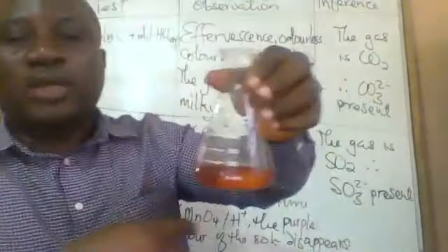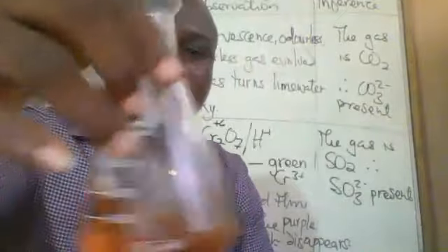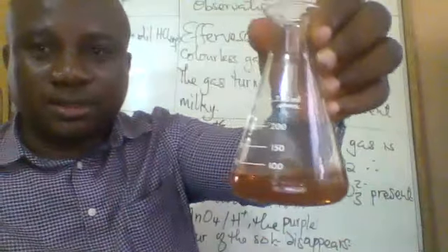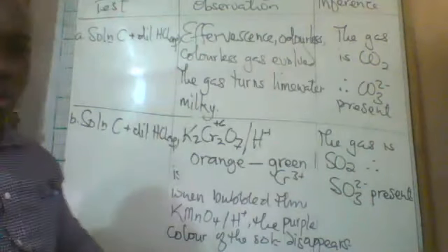It is alcohol that I was adding, pure ethanol. And ethanol is a reducing agent. I think the acid is not enough. Otherwise, it should turn to colorless. Yes. Good.